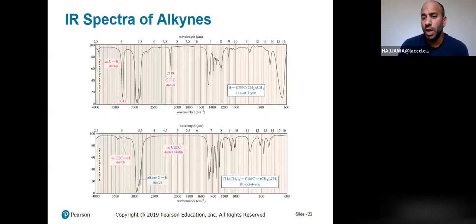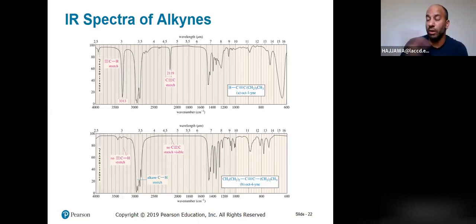The C≡C, if you have that in a molecule, you should be able to see something that's below 2200, and nothing else in that region is going to be anything other than the C≡C. The C≡N will be higher than the 2200. So you're not going to be confused between the C≡C or the C≡N. You could easily tell which one is which. And in addition to the C≡C, you also have the hydrogen attached to the C≡C. That's usually 3300 or above.